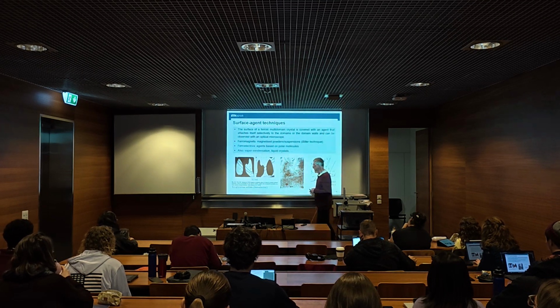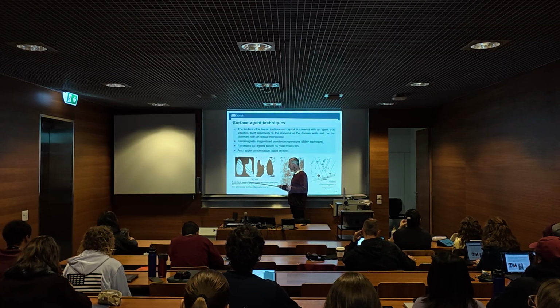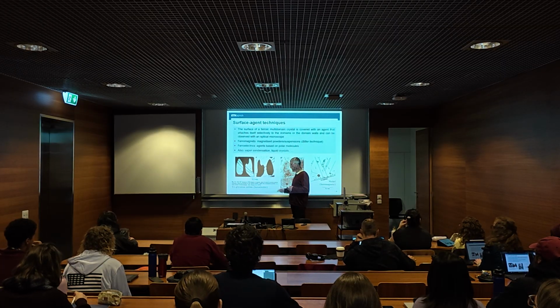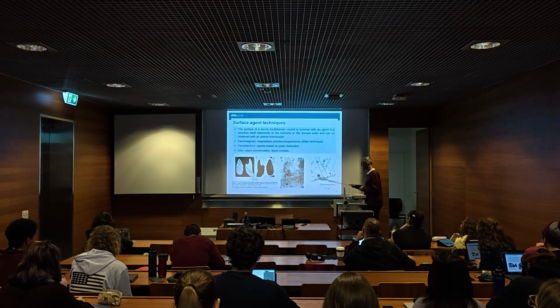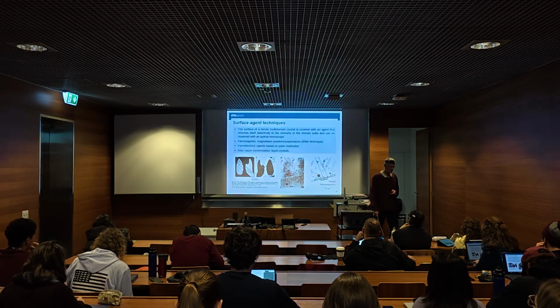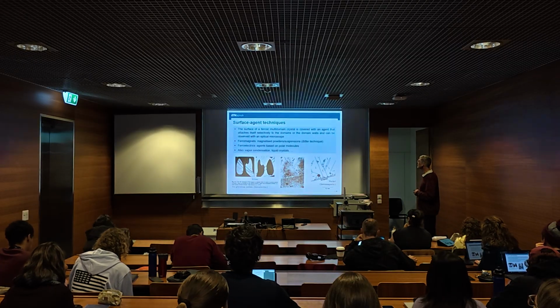So here you have different examples. Here it's dipolar material that images ferroelectric domains, and here it's ferromagnetic material where ferromagnetic particles image the distribution of those. So, surface agent techniques.